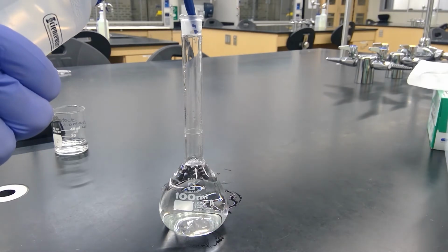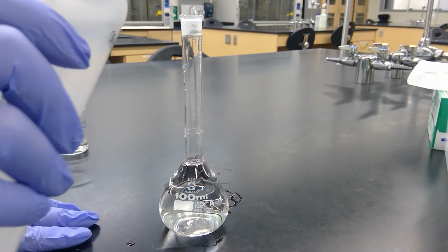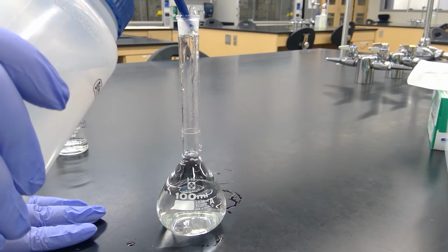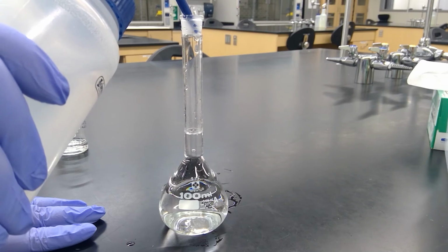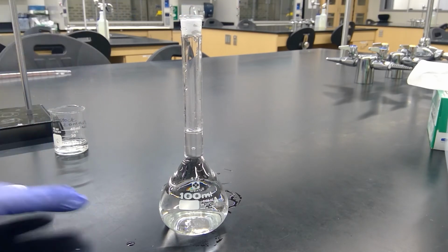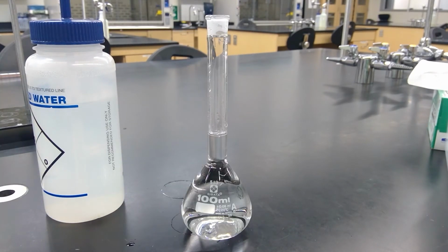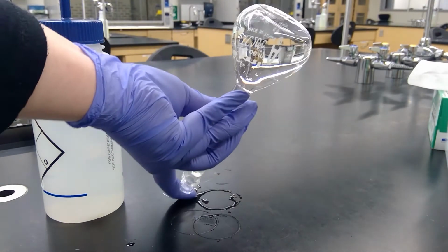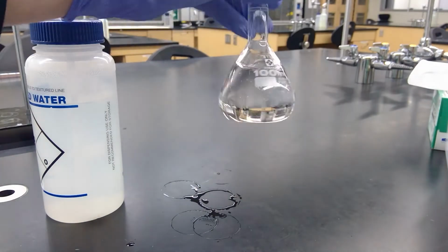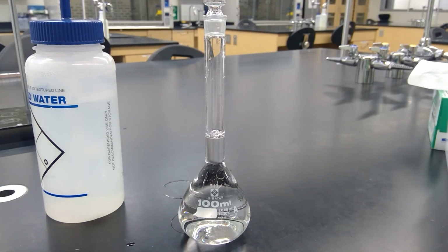And then once you get to the stem part, you'll want to go really slow and make sure that you don't go over that line. Alright, so that's filled to line. One of these lids, and you invert it a couple times.